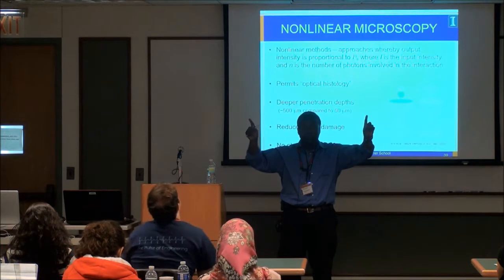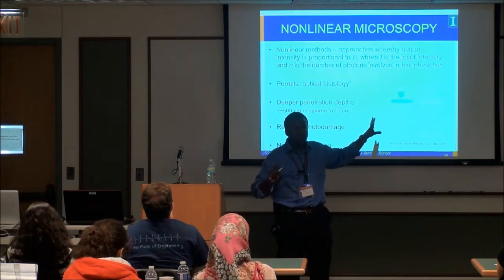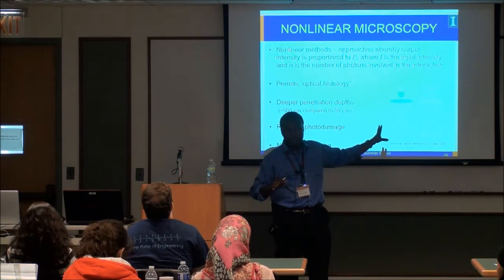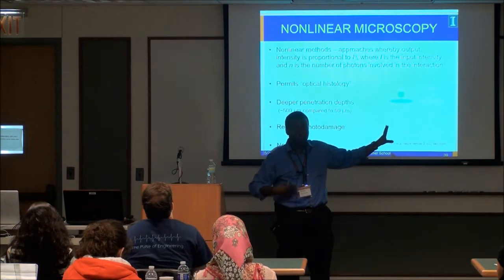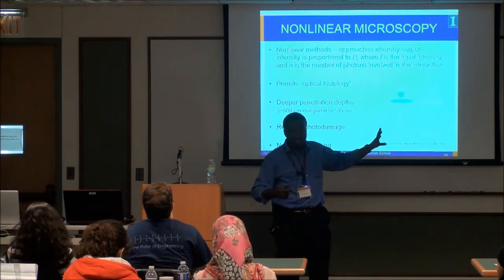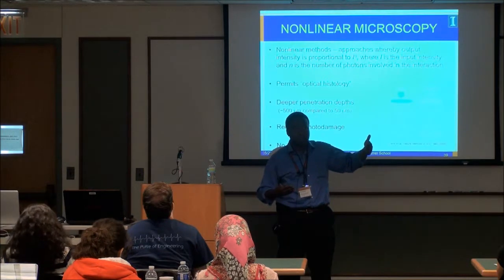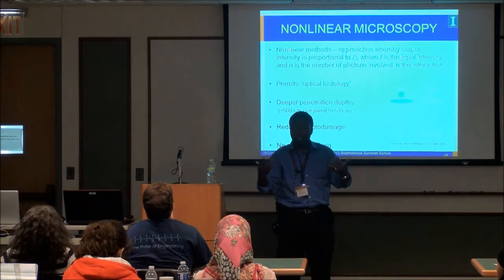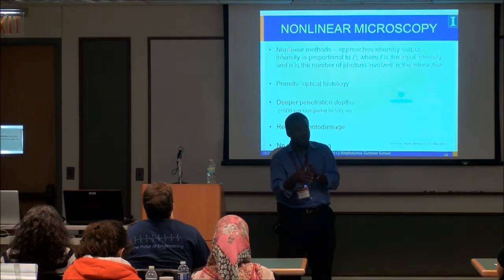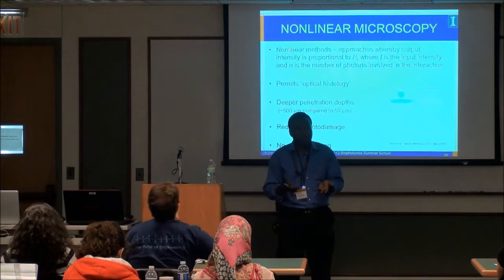Okay? So the spectral phase in particular hasn't really been exploited in imaging yet. In the last couple of years, people are starting to do this with different techniques, like CARS microscopy. They haven't done it with SHG yet, but even two-photon fluorescence. You can enhance the response and reduce the fluorescence from species around the object you want to look at if you can manipulate the spectral phase. But you have to know what you're doing, of course, right?